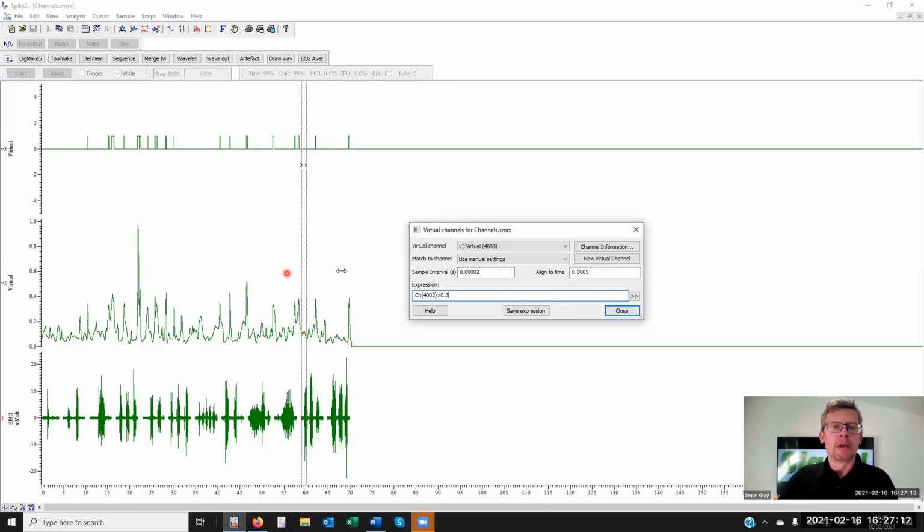Okay. Another thought here is once we've got an open-close state, we could also use this as a trigger to mark, for the cursor 0, I should say, when we get to active cursors, to mark where the beginning of a section of interest may be.